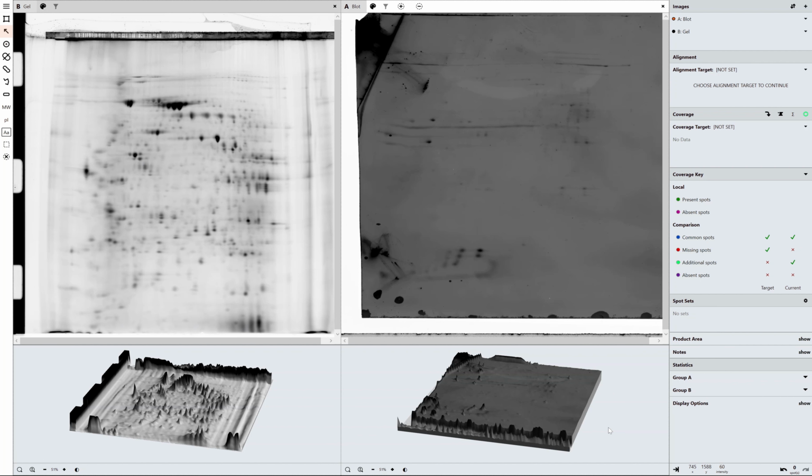We've introduced a number of features within our SpotMap software to try and reduce the pain caused in these particular areas. So I'm going to go through the software very quickly with this demo set of images, which aren't the greatest, but just highlight how we've tried our best within the software to make your data quality better, make your data more reproducible, make the software easier to use, and reduce inter-operator variability due to subjectivity of the technique, and basically make your life as easy as possible when performing this.